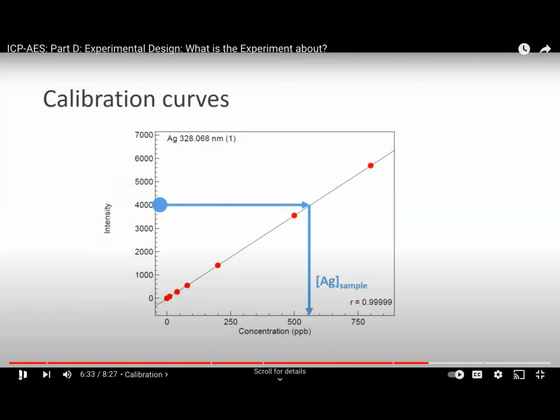In this experiment, this is a manual way of calculating the concentration. Of course, you don't have to do this. The software will auto calculate everything, okay? But of course, you have to construct this properly, from scratch, where you have to measure the salts and make the solution first.